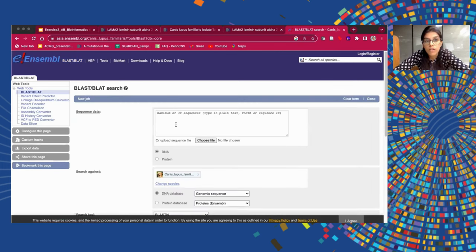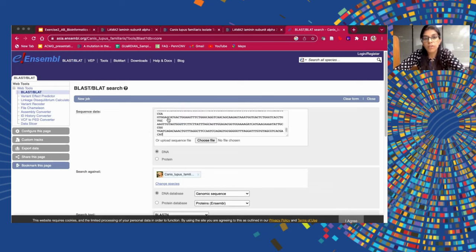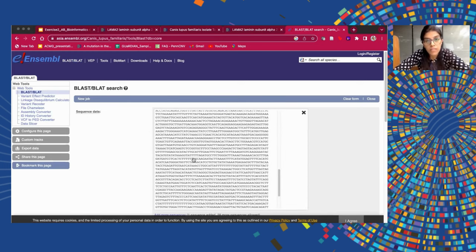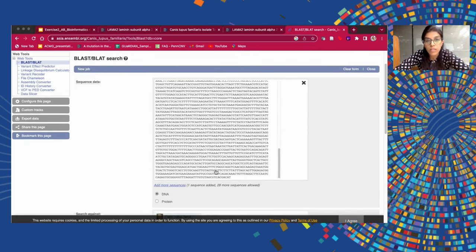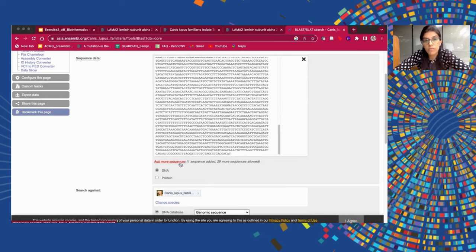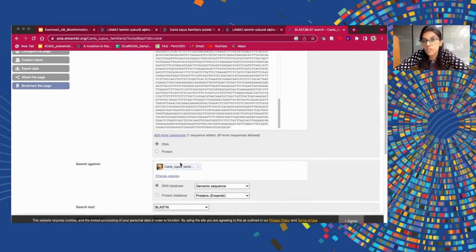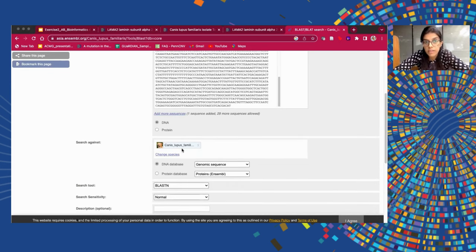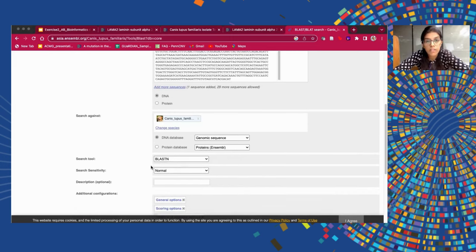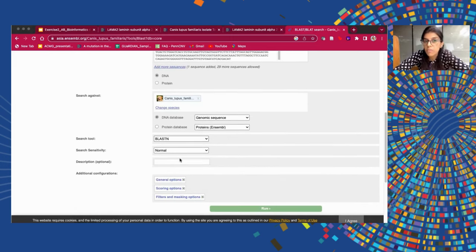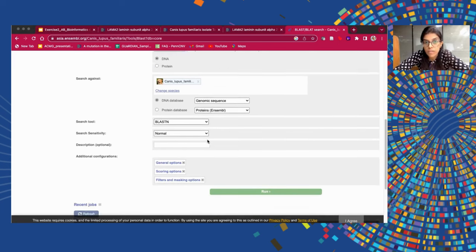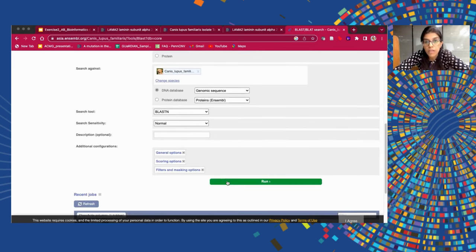We will submit a new job. When you press on 'New Job', you will be redirected to a tab where you have to enter your sequence data. The sequence data I have already copied — this is the random DNA sequence. Just assume this is a random DNA sequence which we don't know anything about; we just know it is a DNA sequence and we need to find out what gene it is. We know it is from the dog's genome, so we have selected it against that species. We are using BLASTN, which is the default selected search tool in the Ensembl BLAST browser. We click on Run.